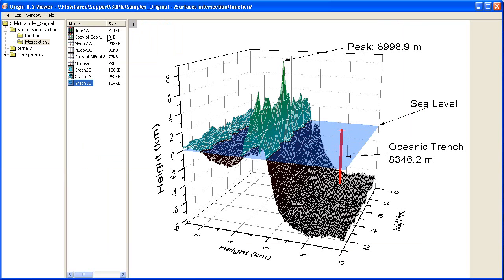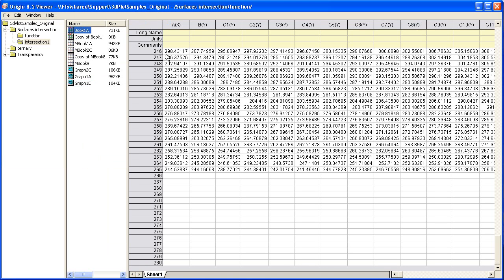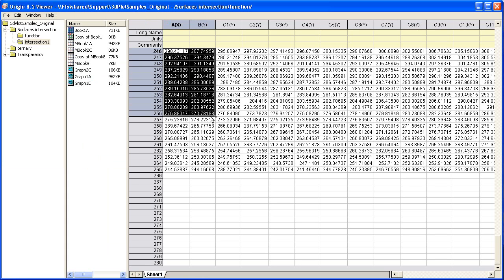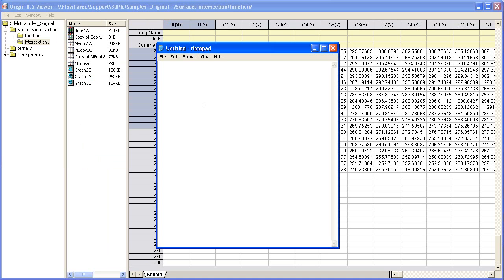The same can be done for Origin worksheets, but can be done without opening a separate window. Simply copy some subset of the data with Control-C or Edit Copy, and paste to an application such as Notepad.